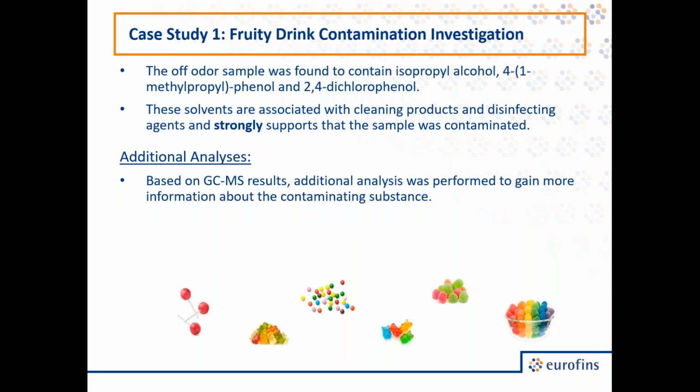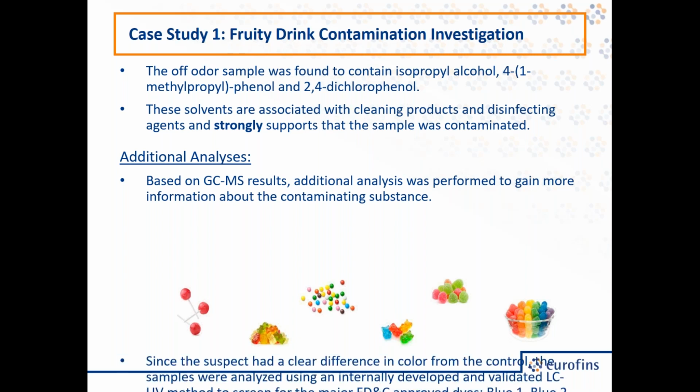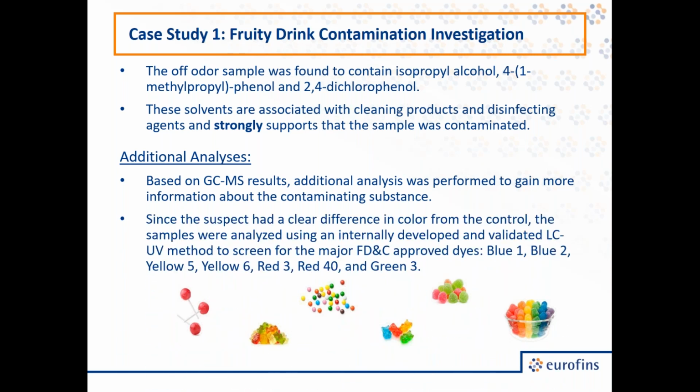Based on our GCMS results, we wanted to gain more information about the potential contaminating substance. And in this case, since we had a distinct difference in color, we also analyzed the samples using an internally developed and validated liquid chromatography method to screen for the major FD&C approved dyes. So these are the common dyes that are approved for use in food, drugs, and cosmetics, such as Blue 1, Red 40, all of the normal dyes that you might see on a food label.